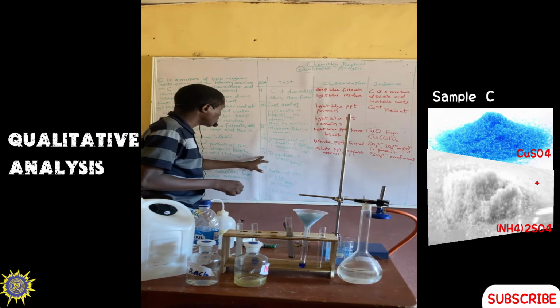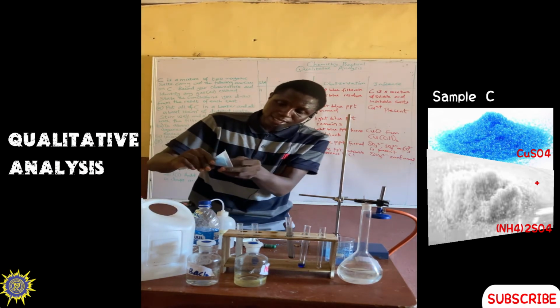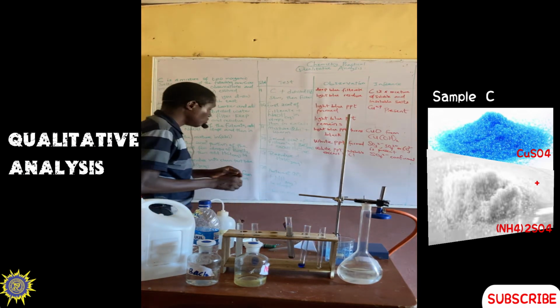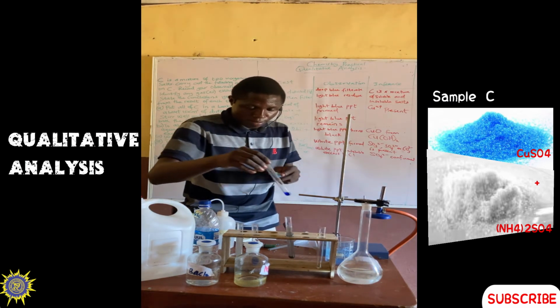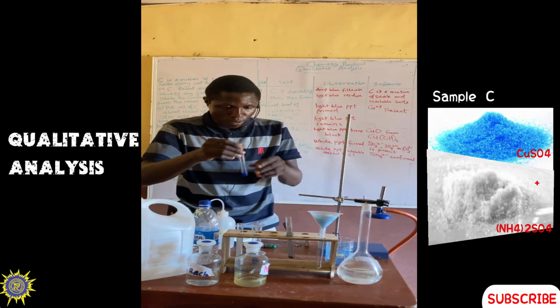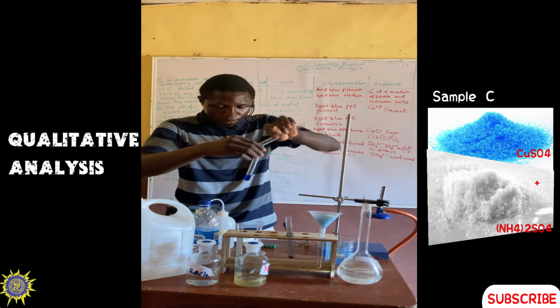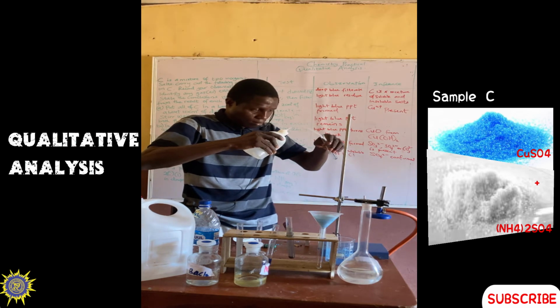The next thing now is Roman figure 1: residue plus HNO3. Now we have our residue here, which is our light blue residue. Now we have to put all of the residue into a clean test tube. So let me rinse this because I don't want to use this broken test tube. Let us quickly rinse it because we have to use a clean test tube.